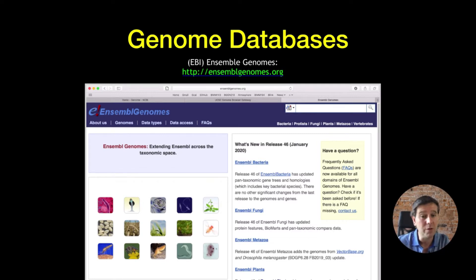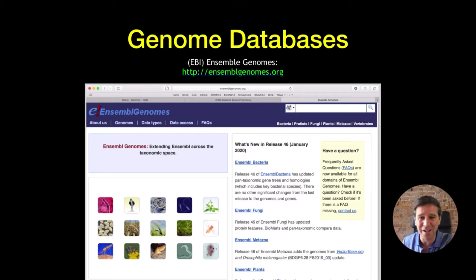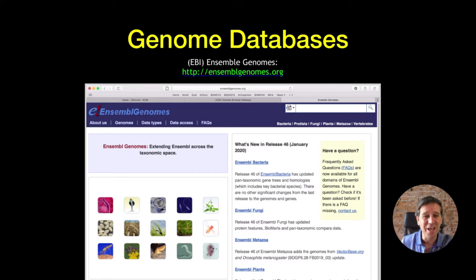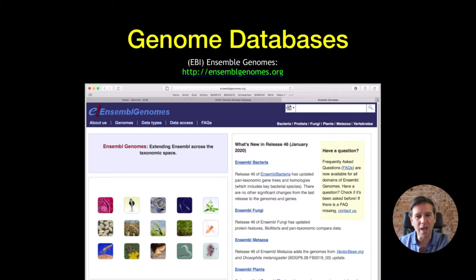We'll actually start in a moment into using Ensembl, and we'll explore some of the data that's there in Ensembl to help us answer some questions. In our hands-on sheet, we'll actually take a little detour to OMIM to look up some disease-associated variants that we'll then explore through Ensembl. So let's just get started.